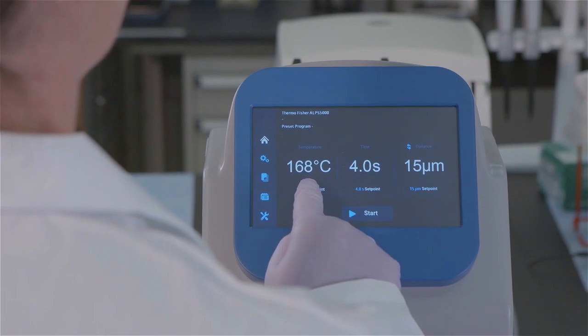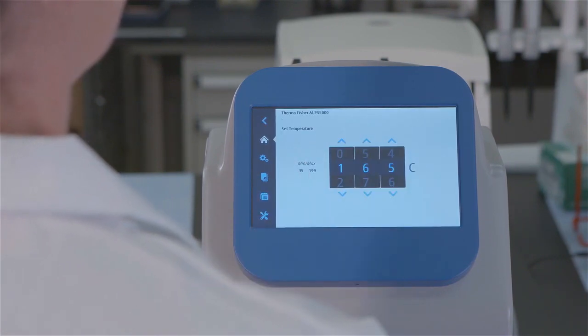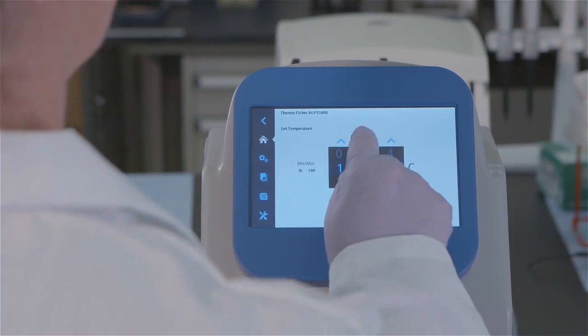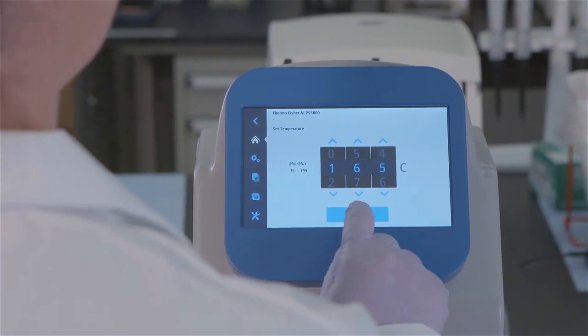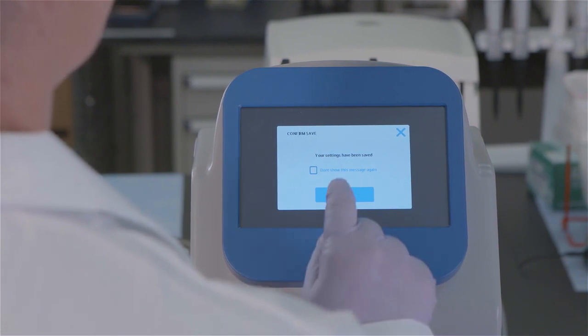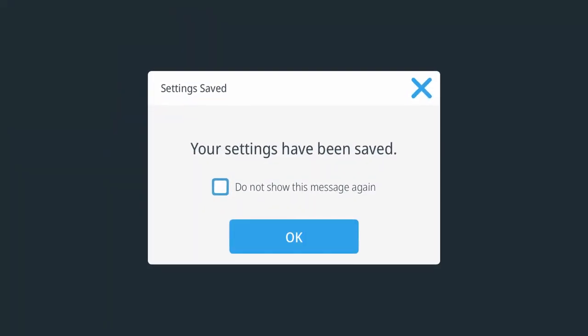To adjust temperature, time or distance, simply tap on the setting to get started. Then tap the stepper control with the up and down arrows to make adjustments. Follow the prompts on the save settings screen to save your settings.